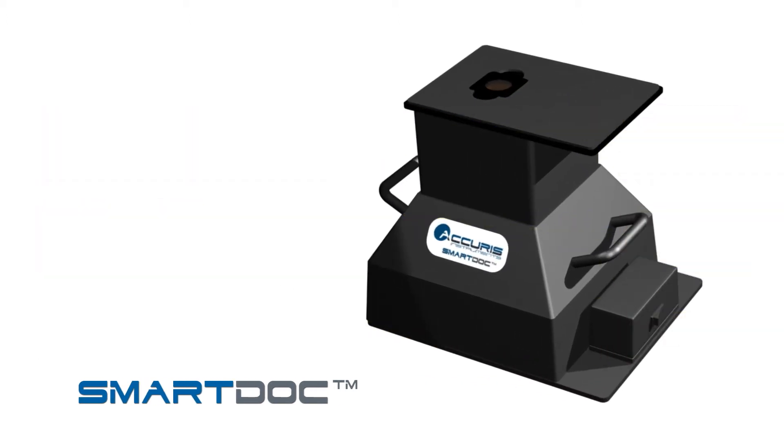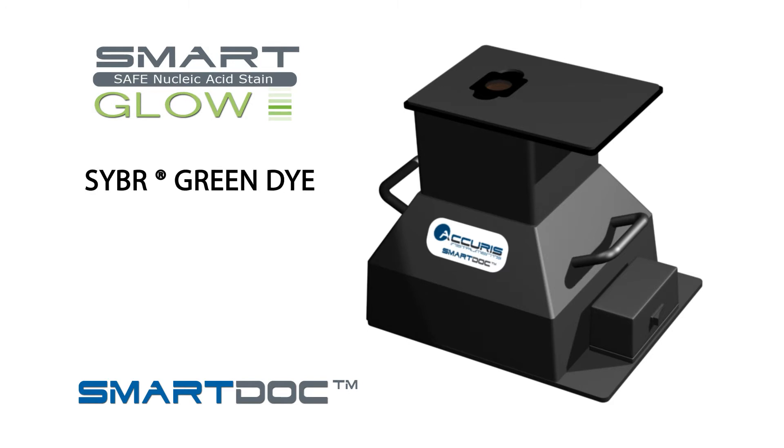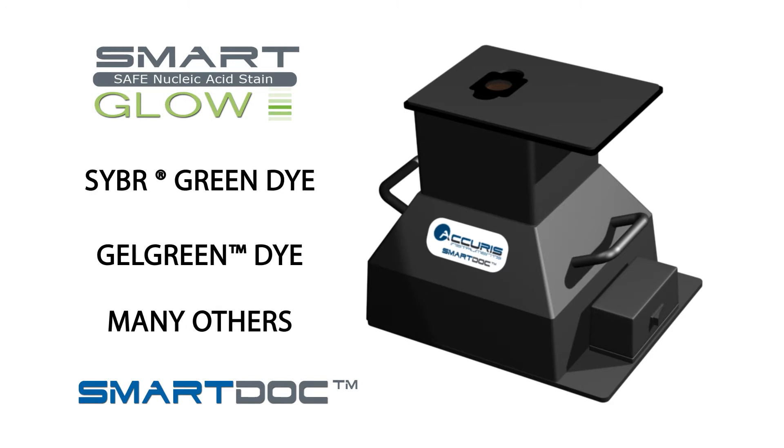The SmartDoc 2.0 system can be used for DNA gels stained with any of the green fluorescent dyes for blue light excitation, such as our Acura SmartGlow stains, SYBR Green, Gel Green, and many others. Check our website for a more complete list of compatible stains.